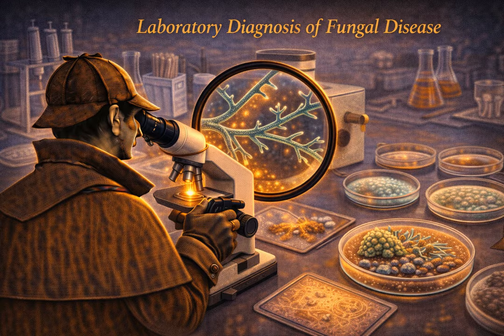If you look immediately after adding the drops, it might not be clear yet. Sometimes you have to warm the slide gently over a flame or a hot plate to speed up the chemical reaction, but you have to be very careful not to boil it or you'll crystallize the KOH and completely ruin the view. It's a bit of an art form in the lab.